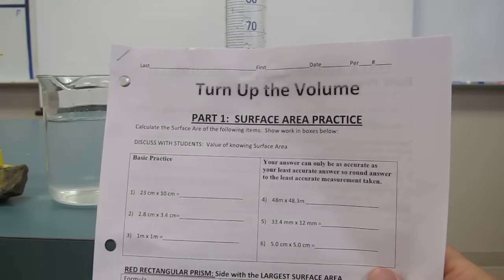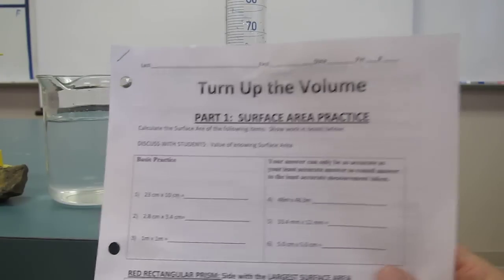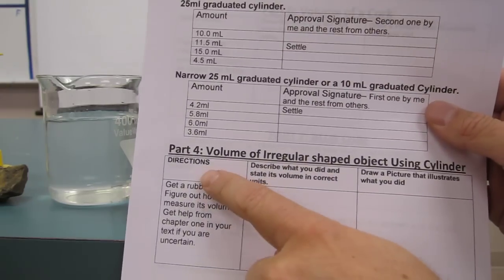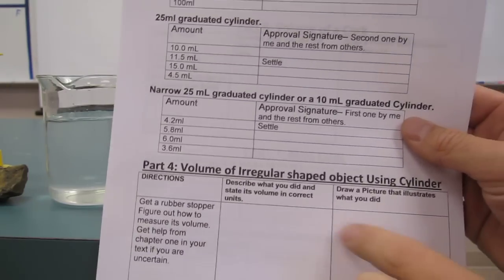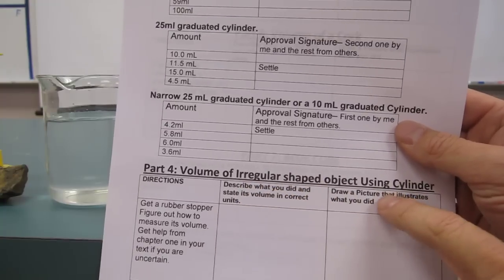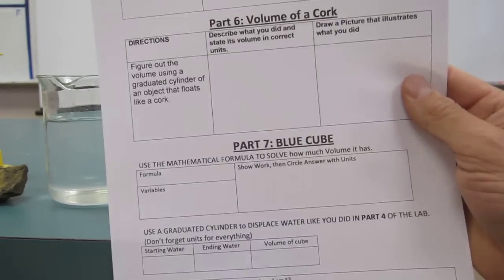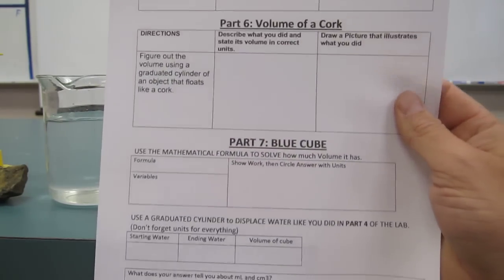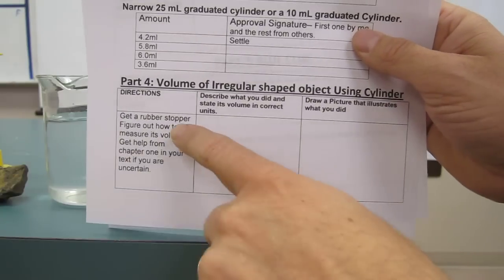This is the makeup for Turn Up the Volume, in particular section 4 or part 4, where we have to figure out the volume of an irregular shaped object such as a rubber stopper, and it's going to continue on till the end of the handout. So part 5, 6, and the blue cube at the bottom. What I'm going to talk about real quick is part 4.